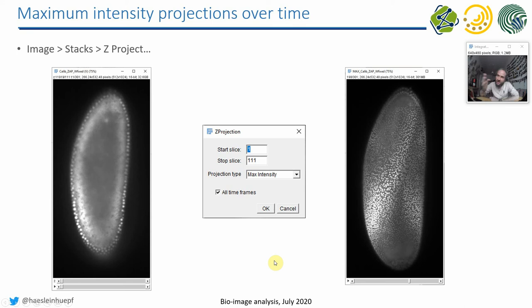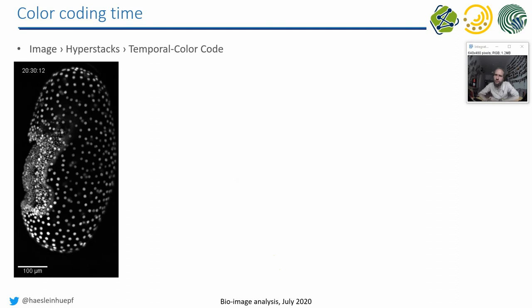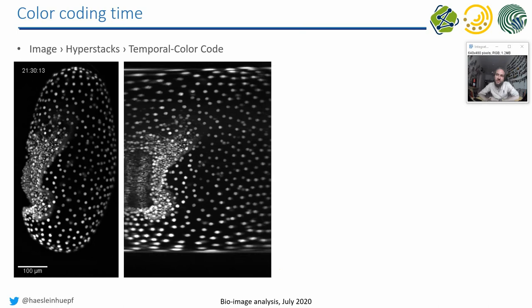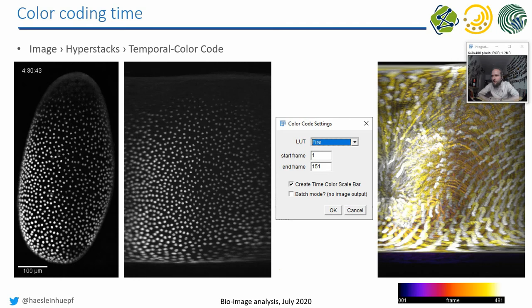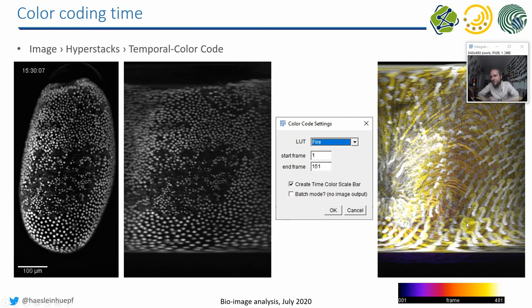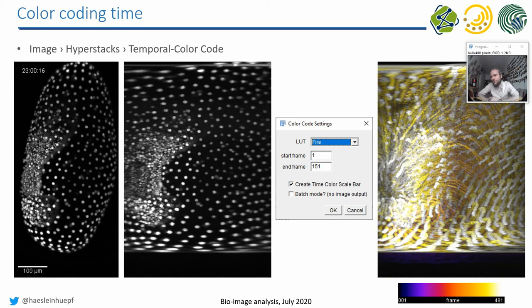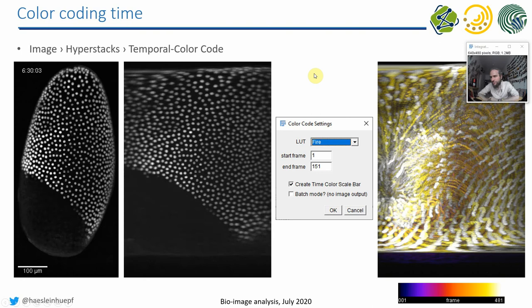Furthermore, a pretty cool tool to visualize, for example, development: you take your maximum projection and you do a cylinder maximum projection of that. Then you can do some color coding of the positions in Z. You use this color coding over time, and then you get these lines which show you the trajectory of where the nuclei were moving. The color expresses the time point when this thing was observed in this particular position.